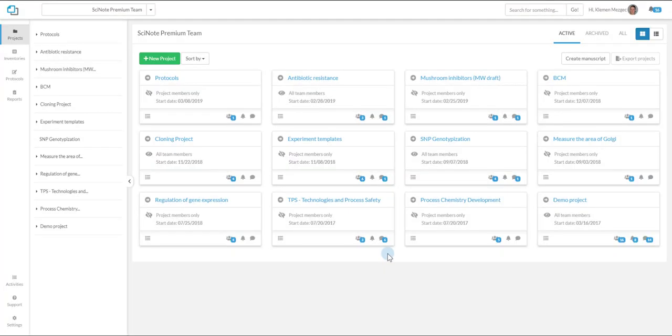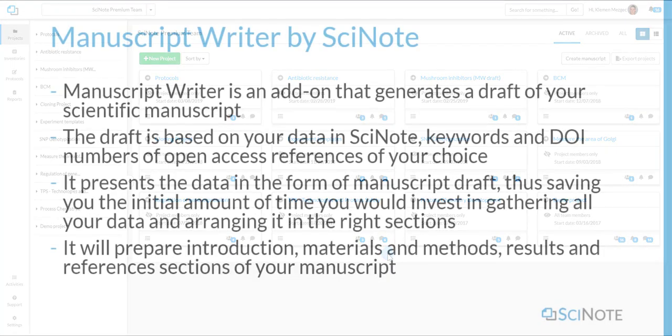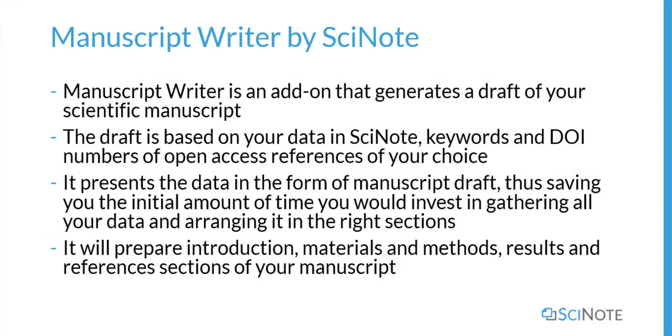Here in this tutorial you will learn how to use the Manuscript Writer add-on in SciNote. First to begin with, the Manuscript Writer is an add-on that generates a draft of your scientific manuscript.